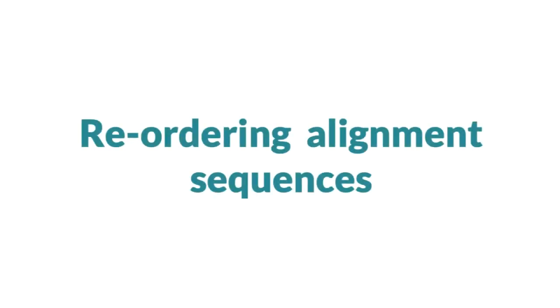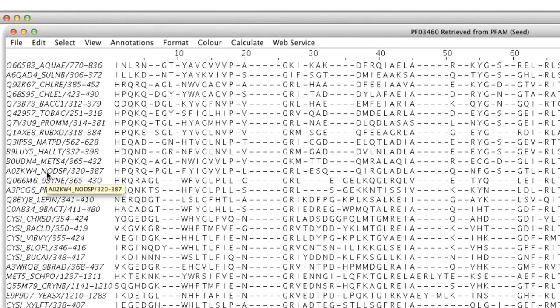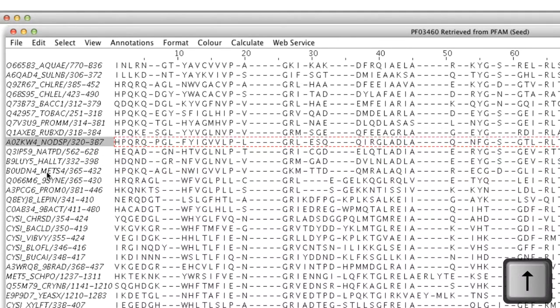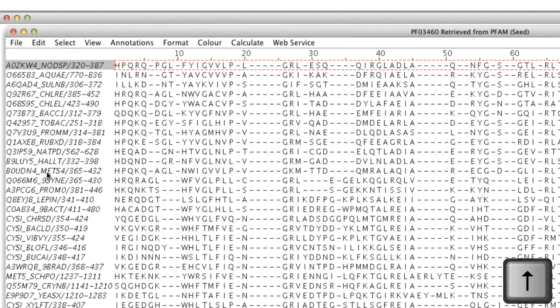The sequences in my alignment can be reordered. Let me show you. I select a single sequence by clicking on the Sequence ID panel and use the up arrow key to move it to the top of the alignment.